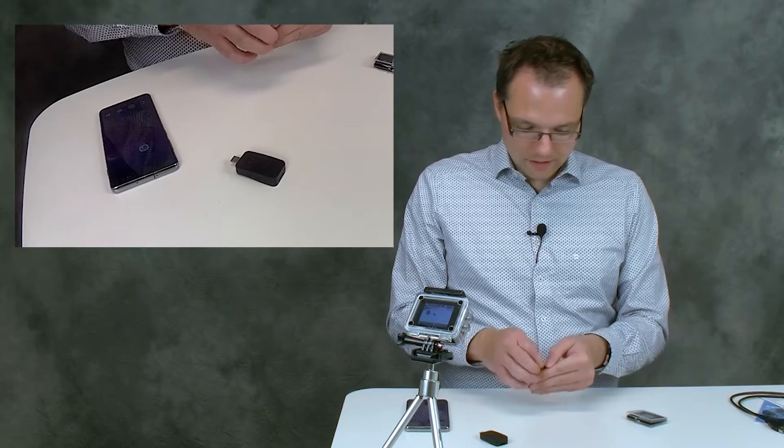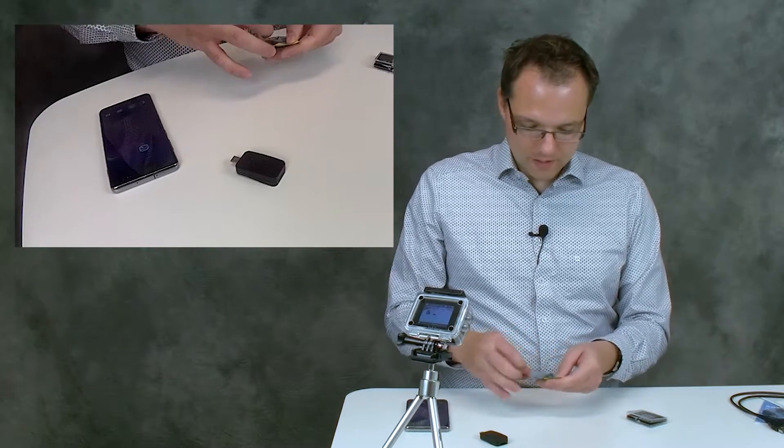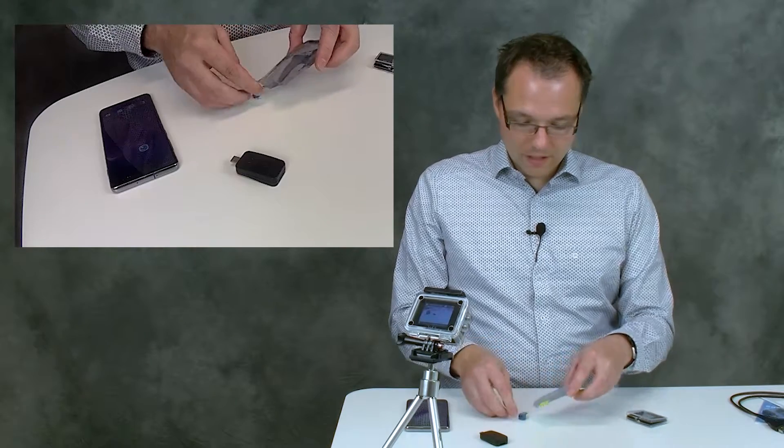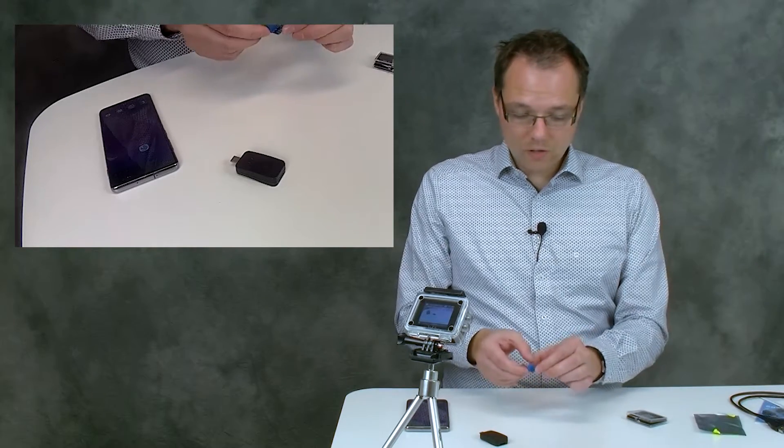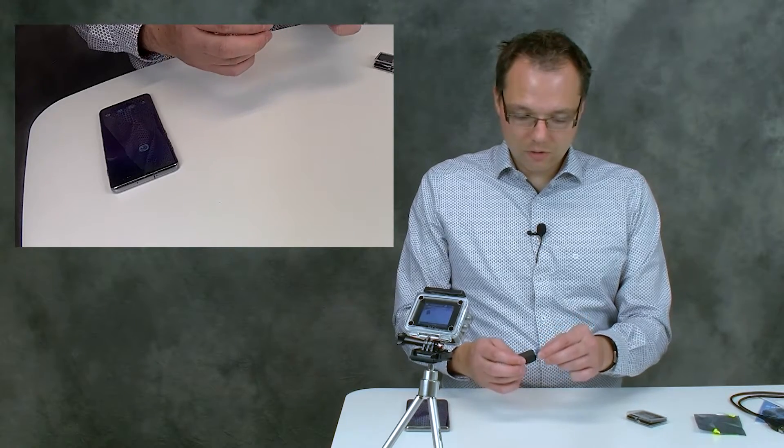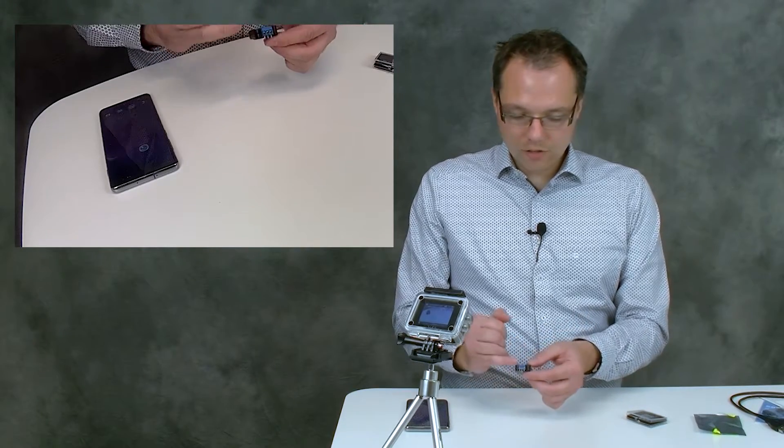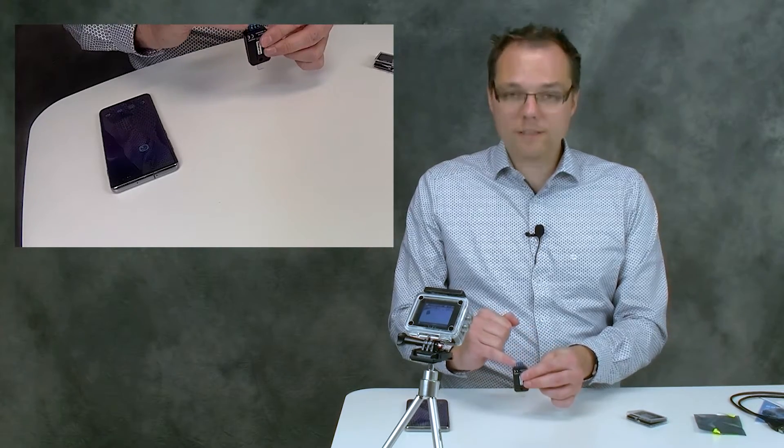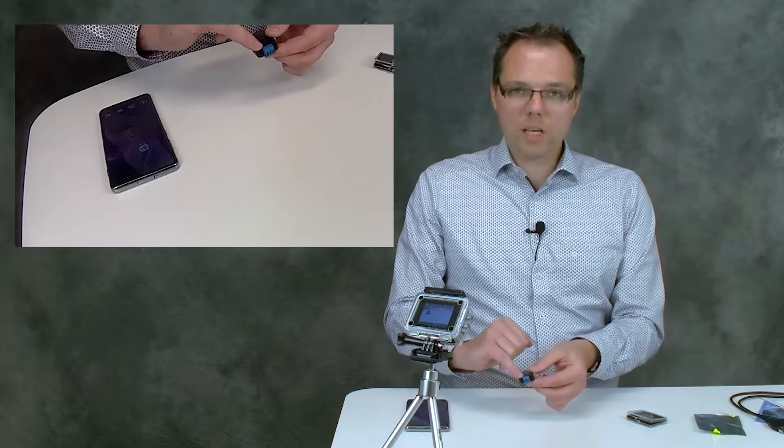Then we have in this box, and this little bag, an adapter that converts the SPE connector into a screw terminal. So you can just insert cables here and screw them tight with these screws.